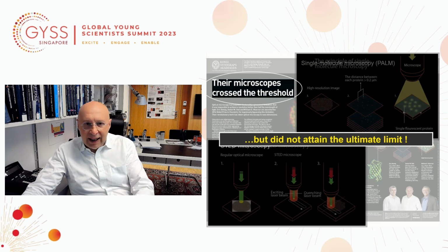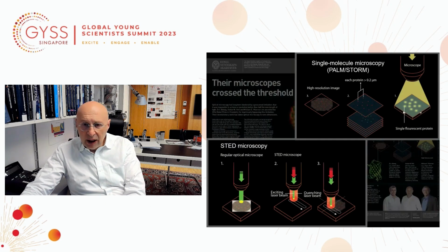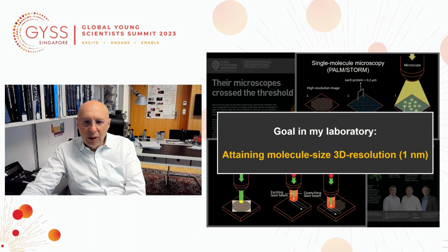Therefore, I'd say that while the microscopes crossed the threshold, as it was put here on the poster, they did not attain the ultimate limit. And this is the reason why in my lab, after 2014, we put a lot of emphasis to get down to the ultimate limit, to get a spatial resolution that reaches, say, the 1, 2, 3 nanometer scale, so the size of the molecule itself.